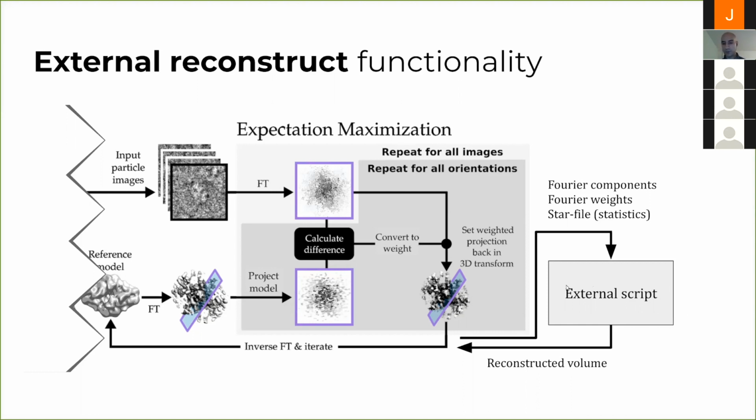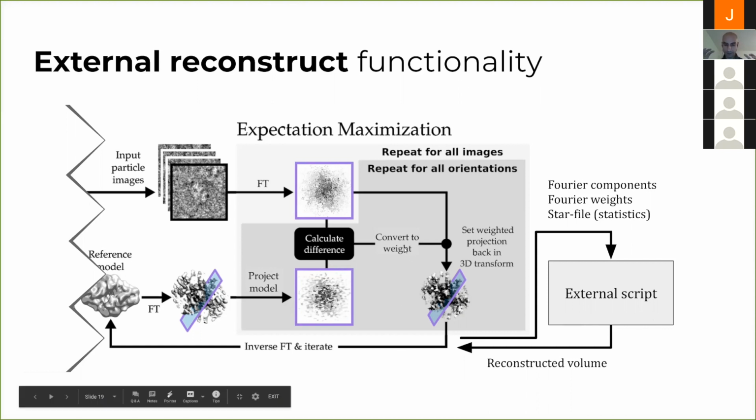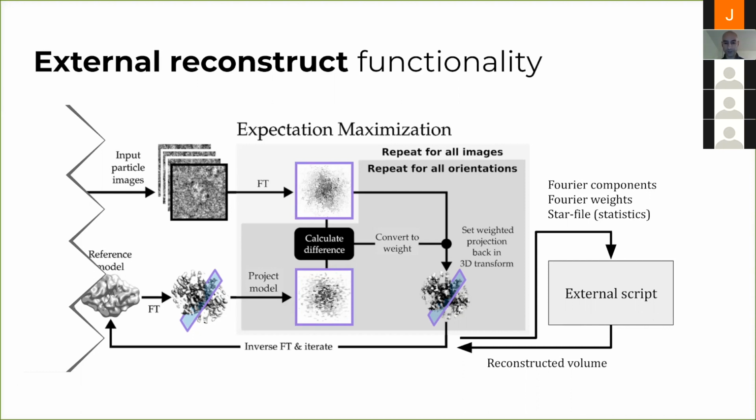And then you would reconstruct a model and plug that back into the Relion reconstruction algorithm, and then Relion continues doing this. This allows the user to do scripting at the heart of the reconstruction algorithm, which is usually quite difficult. And we hope to introduce more of these kinds of hooks into Relion to allow users to experiment with other types of algorithms rather than ones that we have previously programmed.